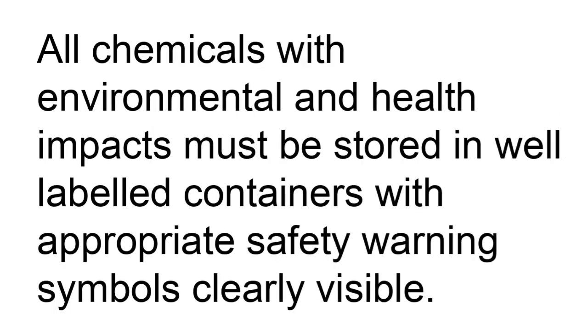Now, chemicals which have environmental and health impact must be stored in well-labeled containers with appropriate safety warning symbols clearly visible.